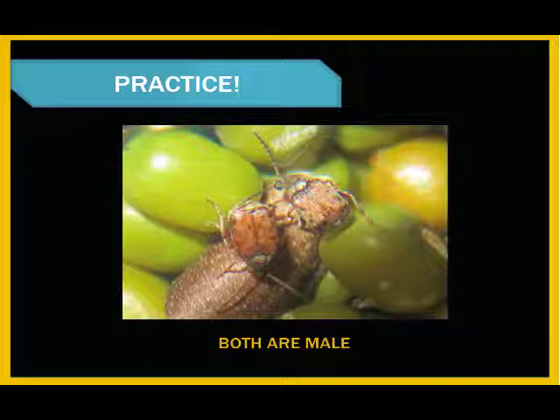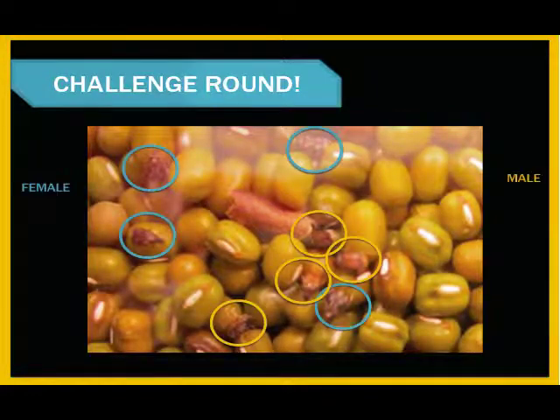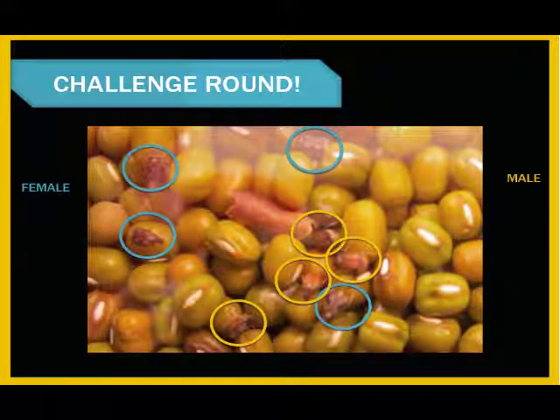This one is a bit trickier, as both are males. Notice that neither has an X pattern on the back, and both appear smaller in size. Now let's try one more time. With so many beetles to look at, that round was even more challenging. The four beetles indicated by the blue circles are females, identifiable as a result of their comparatively large size and the X pattern on their backs, while the four beetles indicated by the yellow circles are males, as they are relatively small and boxy and boast only the brown color on their backs.